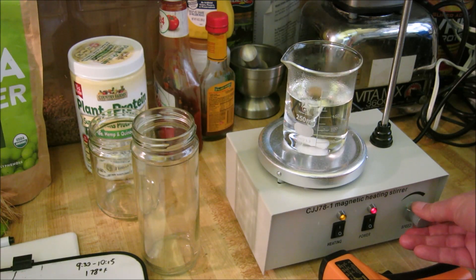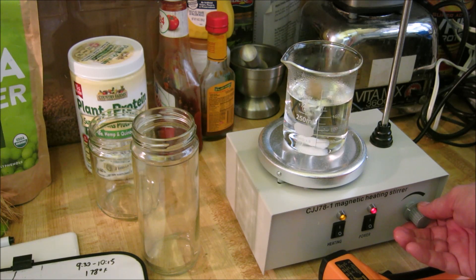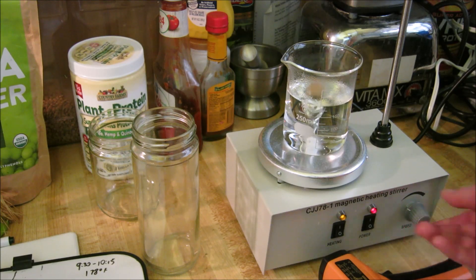It's a pretty good little device so far, for the price especially. So check it out guys if you're interested. And if you're making chemical stuff at home, this is something you might want to look into. It's a lot of fun too.